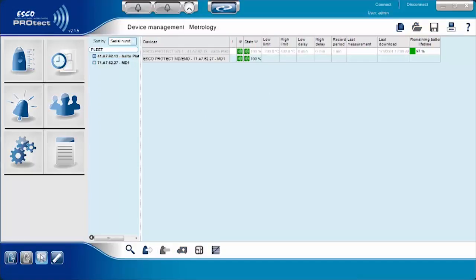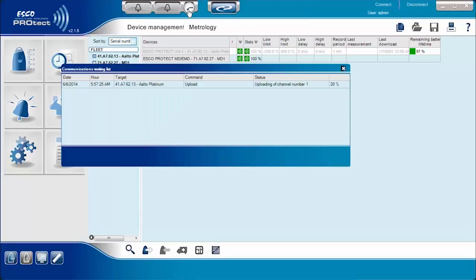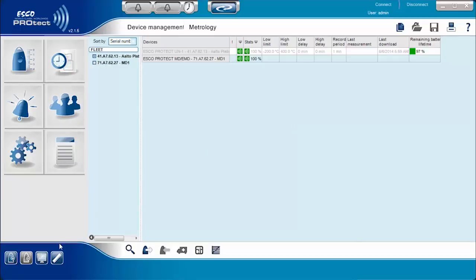Select the Upload Measurement icon in order to retrieve data gathered by ESCO ProTech devices. Afterwards, to show the last data measurement by the ProTech device connected on the system, the user needs to click the Last Measurement icon.